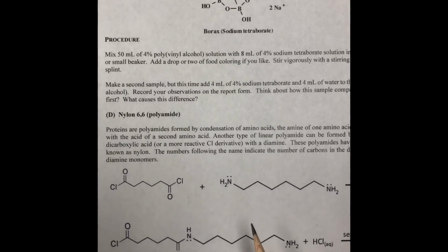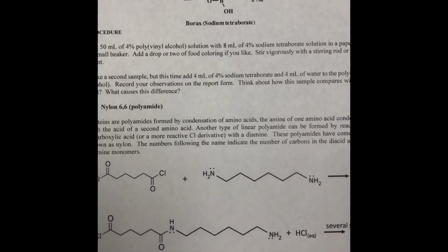What happens then in the condensation reaction is that one of the amino groups on the 1,6-hexane diamine will react and displace the chloride, the chlorine atom, to make an amide bond. Here we're mimicking what happens in nature when living systems take amino acids and produce amide bonds. Then the unreacted end of the 1,6-hexane diamine can find another molecule of the adipoyl chloride, and so forth. It can continue on until you have a multi-strand chain, repeating subunits, and we call this nylon.